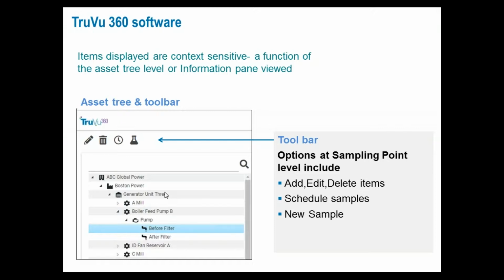And locations are a fairly arbitrary designation. You may have just one location at a site, or you may have building 1, building 2, building 3, for example, as 3 distinct units where your assets are, and you want to group them together because perhaps there's different people responsible for them, or you want to make it easier to set up scheduling of sample routes, that sort of thing. Finally, you get multiple locations, completely flexible from that perspective.